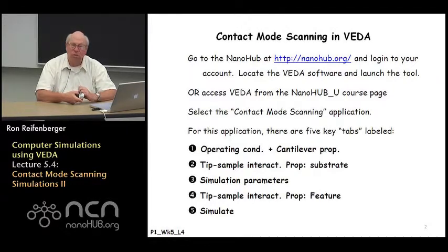If you do a simulation and you do not choose to include tip dilation effects, the VEDA calculation typically takes a minute or so. If you include the tip dilation effects, the calculation takes a little bit longer, maybe 2 or 3 minutes.